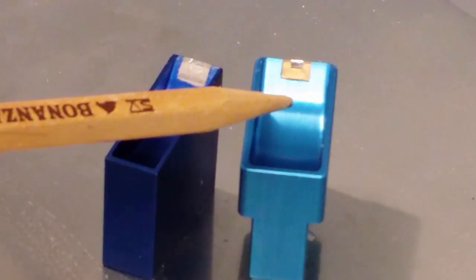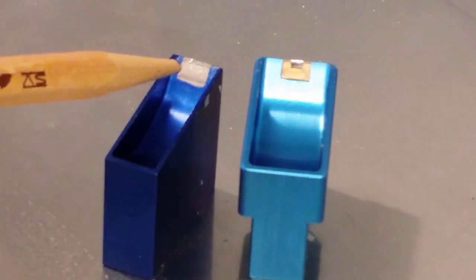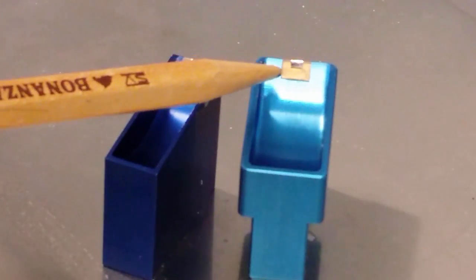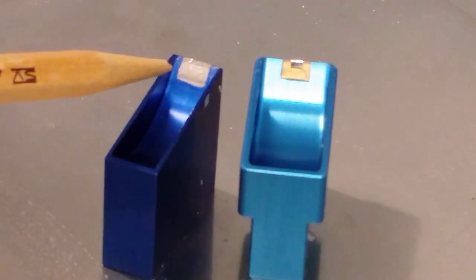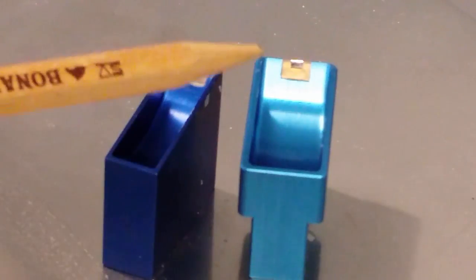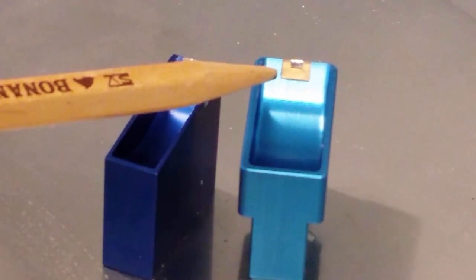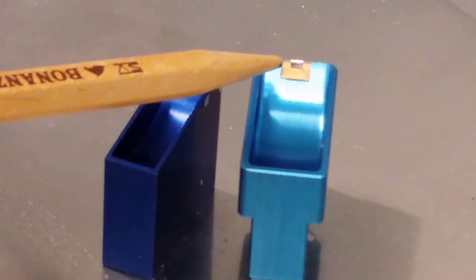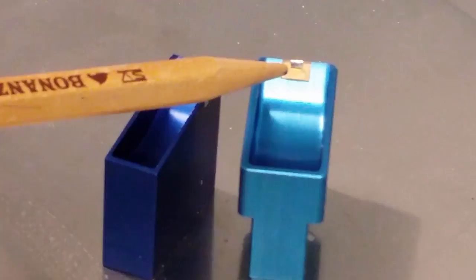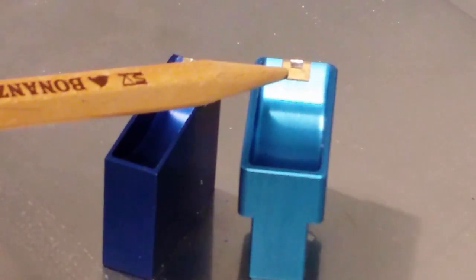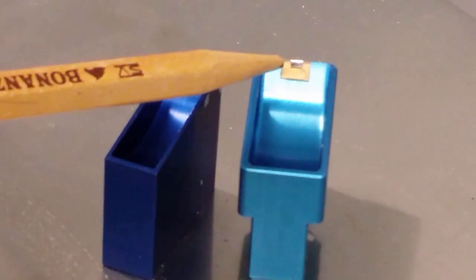The difference between these boats, as you see here, is that this diamond knife on the right one compared to the left one has different lengths. So you can buy different sizes of these diamond knives. That is just a cost related question. The other thing is that the edge shape, the angle of the edge of the knife, can be of different degrees. You can buy different of those as well, depending on what you want to cut.